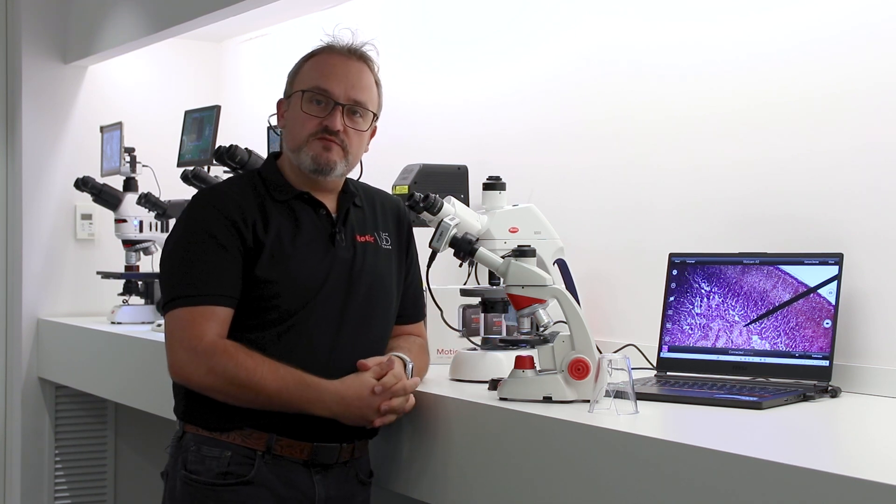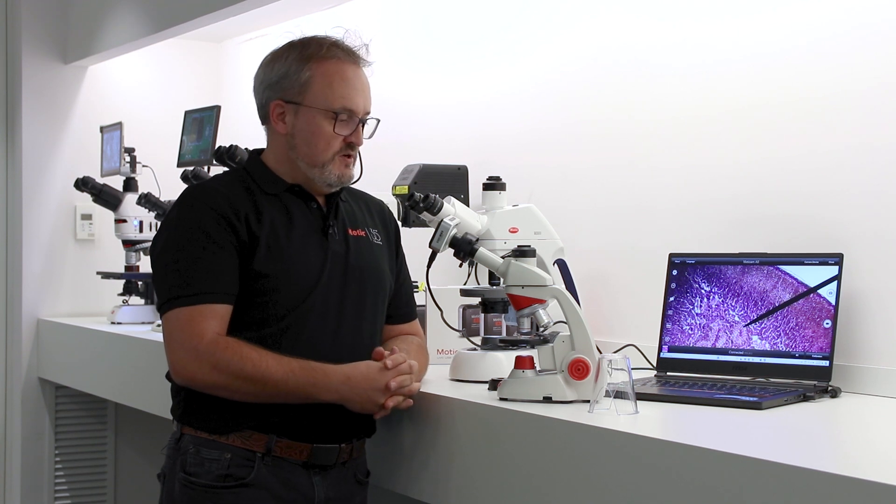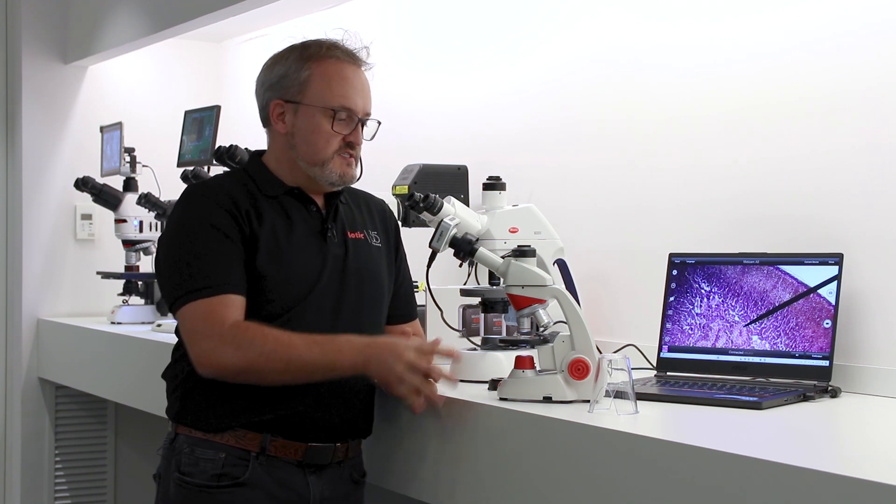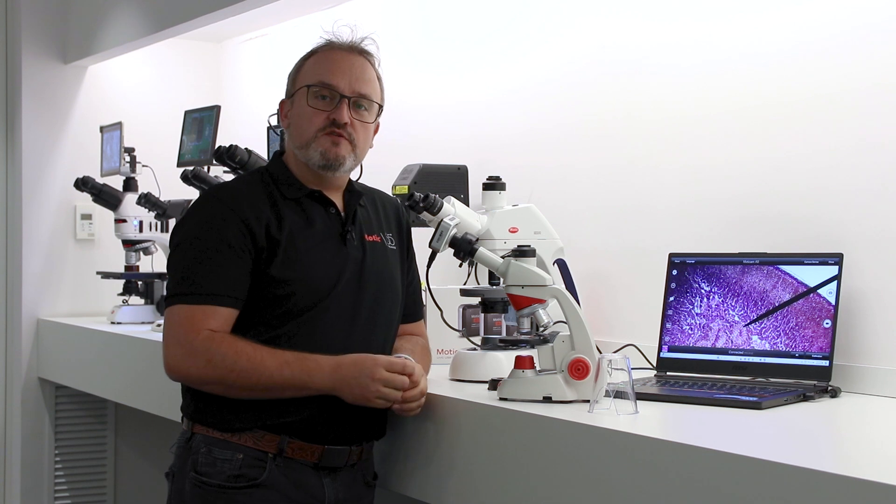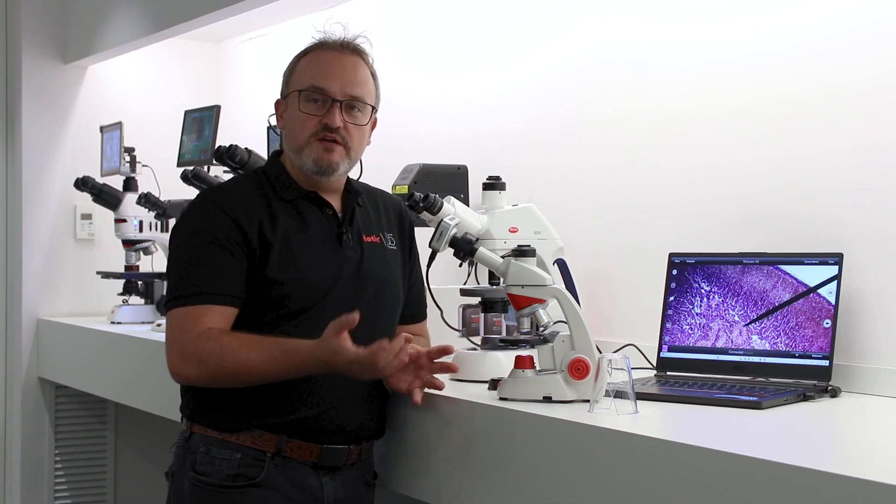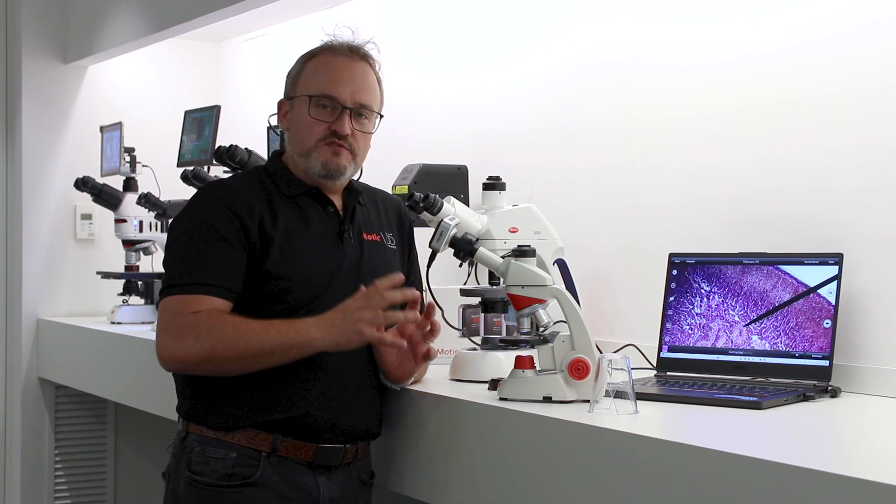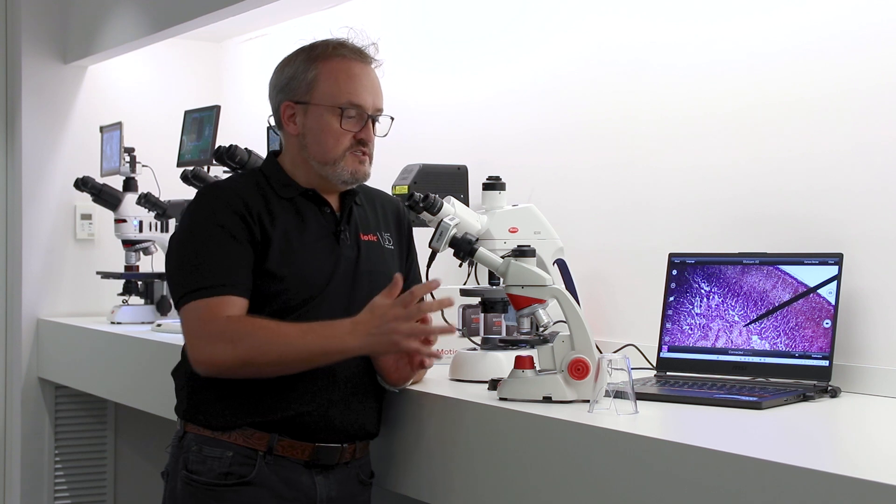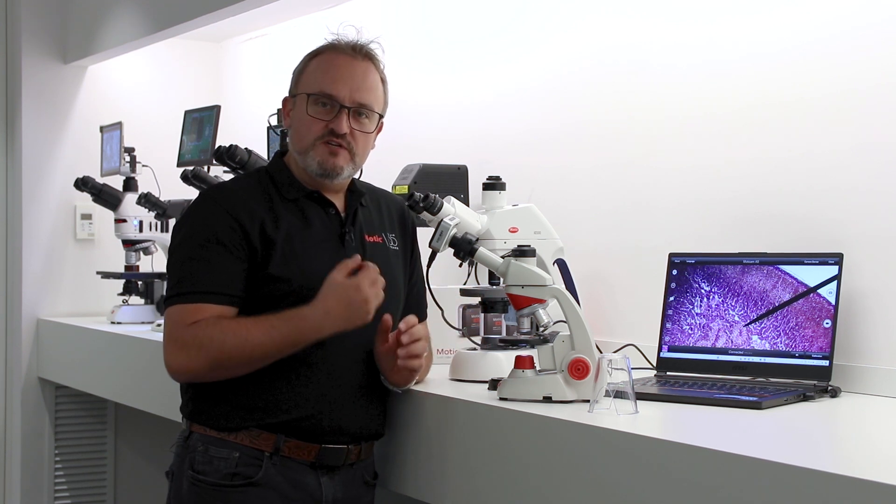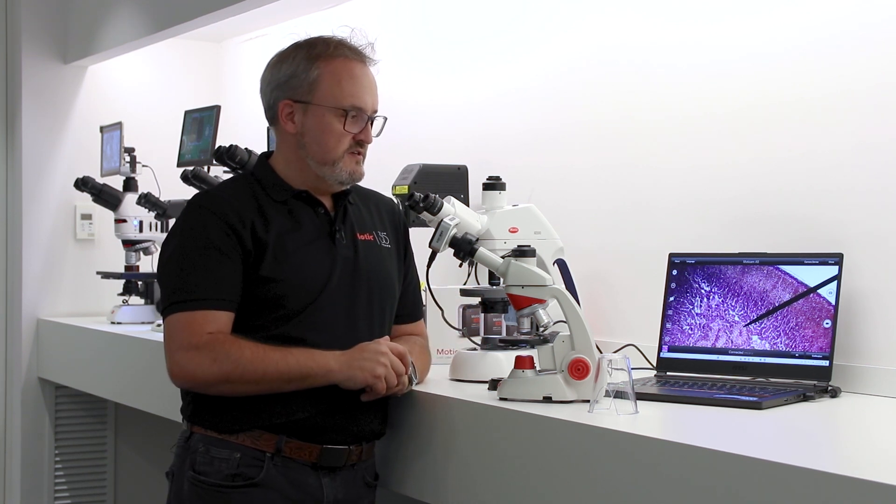Again I can capture, annotate, measure, and learn from the image. Even a small microscope like this can now be used by several people at the same time. What is important with any MOTICAM is that you quantify the image, you learn from the image, you take the image out of the microscope, and really the focus then is on what the image is and what it tells you and what you can learn from it.